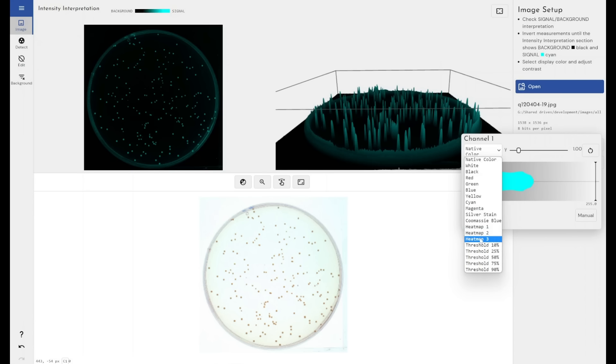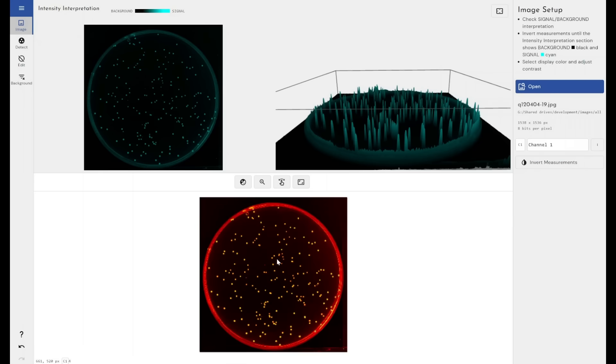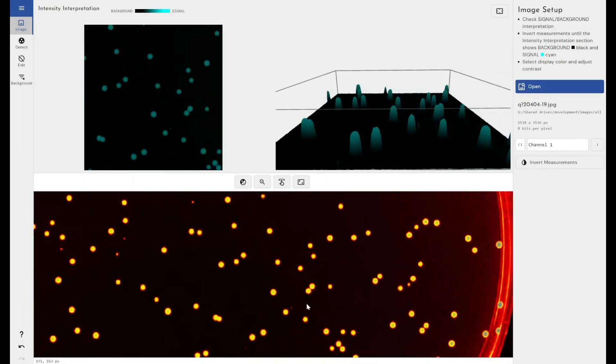But if I had a high background signal that was very close to my colony signal or they were very similar colored, I could apply something like a false color heat map. This would help me massively when trying to define the edges of my colonies.